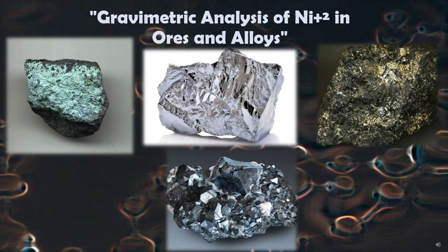Today I am going to explain gravimetric analysis of nickel plus 2 in ores and alloys.